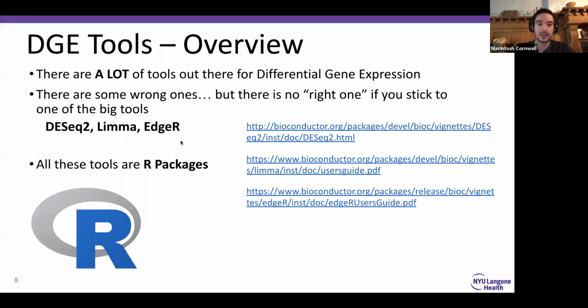All of these packages are R packages, supported by the channel Bioconductor, which may have been touched on before. Bioconductor is a specific repository of R packages that's highly curated and well maintained. The vignettes for these are quite good. I included these as clickable links within this PowerPoint so you can see for yourself. They really go into a lot of detail and they provide a lot of information.